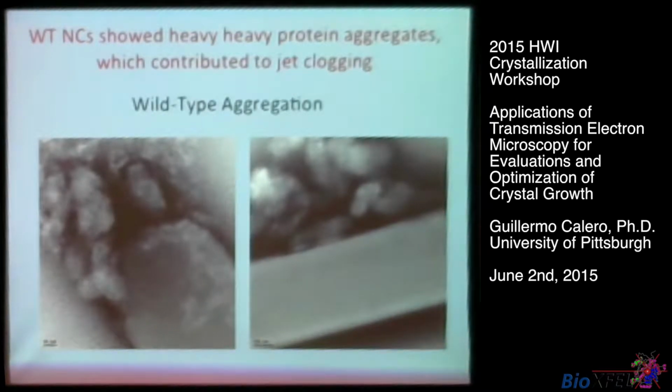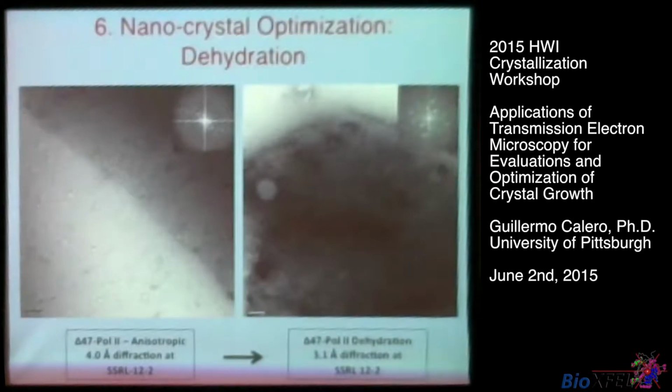So they did get some hits at 2 angstroms, which are here, but mostly were not good. And the other thing that happened to that sample is that the jet kept clogging. Right? So with this, we think, and actually we're writing a manuscript about this, that TEM is a really good way to pre-characterize your sample before taking it to the CXI.